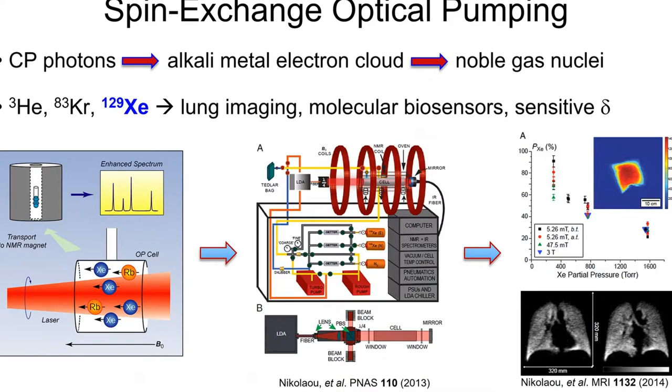And so for hyperpolarization, there's three main types. And the first one I'm just going to mention briefly, that's spin exchange optical pumping. This is the only slide I have about optical pumping. And I only have it on here because optical pumping was my first true love. It's the reason I got into research to begin with. As an undergraduate, I was in my early 20s, and here I have this real mad scientist type of experiment where you have lasers and magnets and liquid nitrogen and alkali metals that will explode if you expose them to the air. It's really, really neat stuff, and it got me into science, and I did a lot of science on it. I don't so much anymore, but I did.